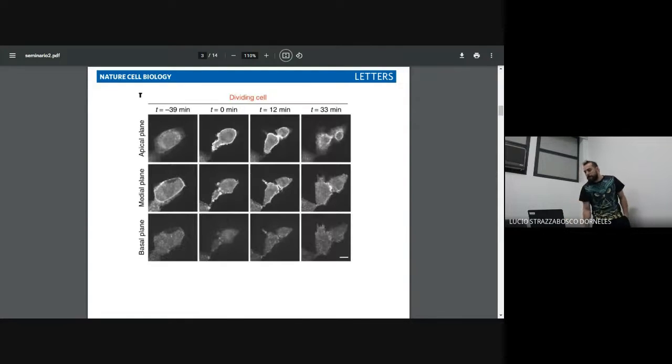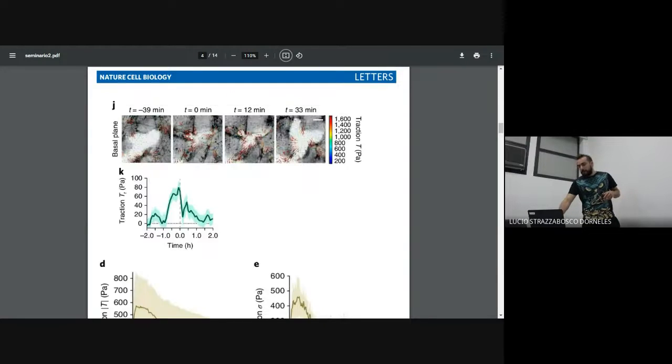In the next image, I show only the cells, and here we can see one cell turn into 2 cells. And this is the particular change in the area of the cells. They used the area to understand these changes in mitosis.